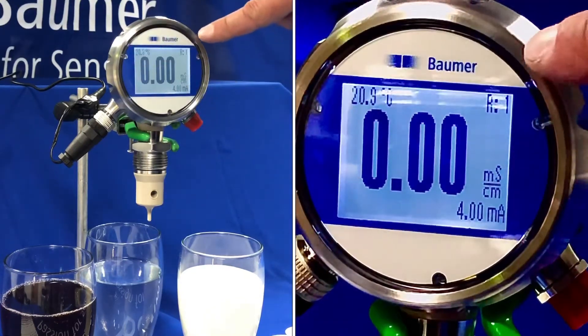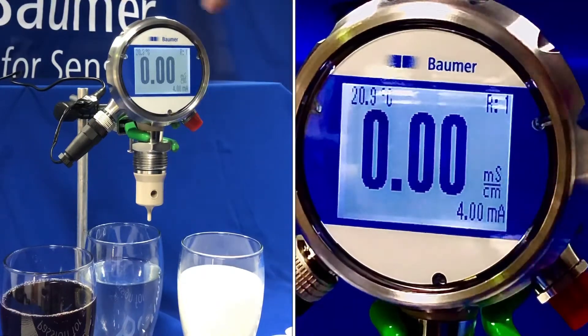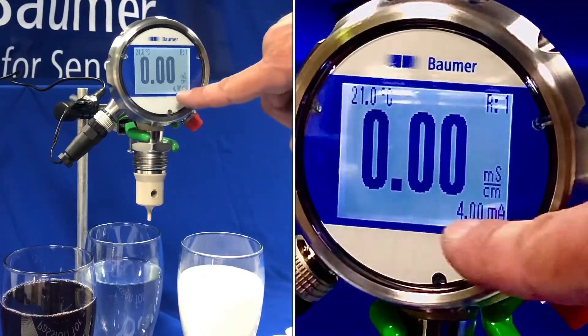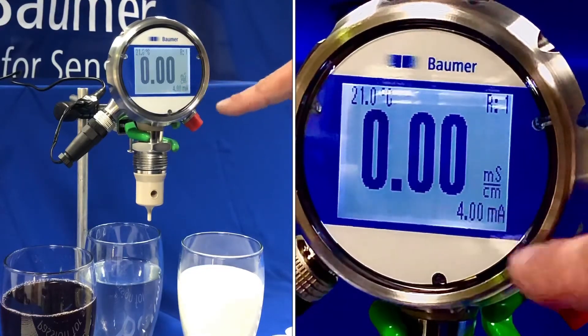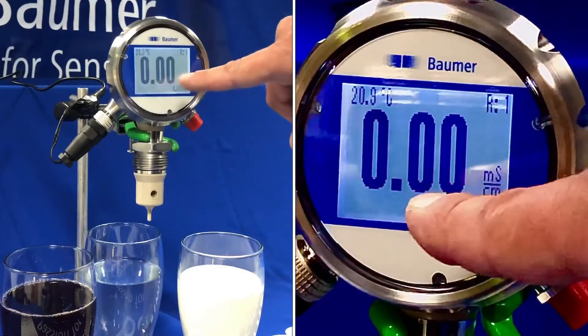The display itself has two built-in relays so you can switch depending on either current or the millisiemens reading. I'm also showing the current value — the 4 to 20 milliamp value — and I've labelled the media, which we can display in the bottom left-hand corner.